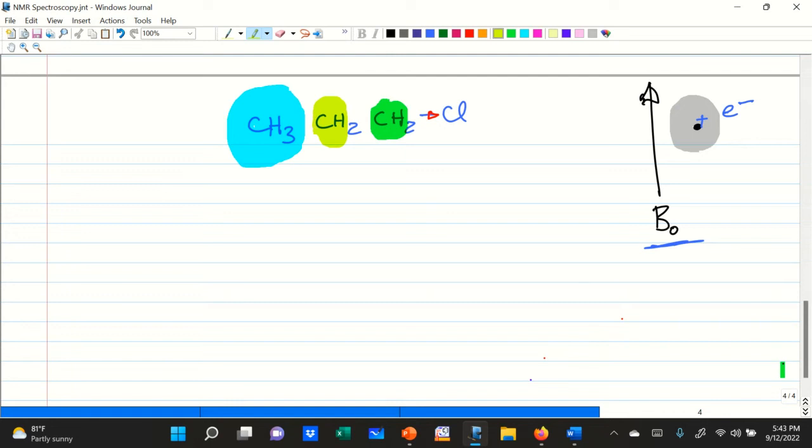So if I draw the spheres in a proportionate way, it is going to look something like this. Here you can see this one is most highly shielded, and I am showing it with a much bigger colored bubble. So that shows different levels of shielding.